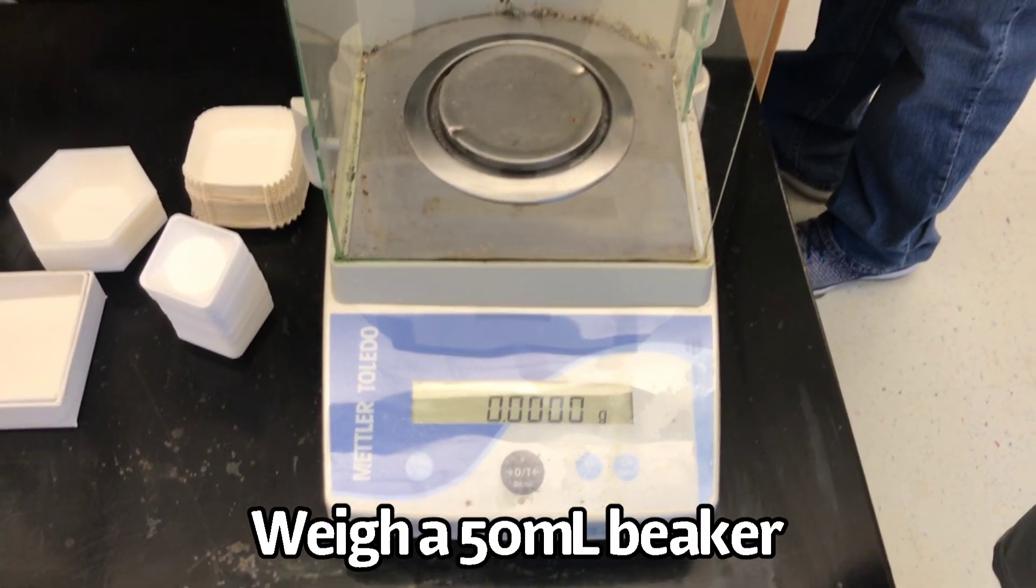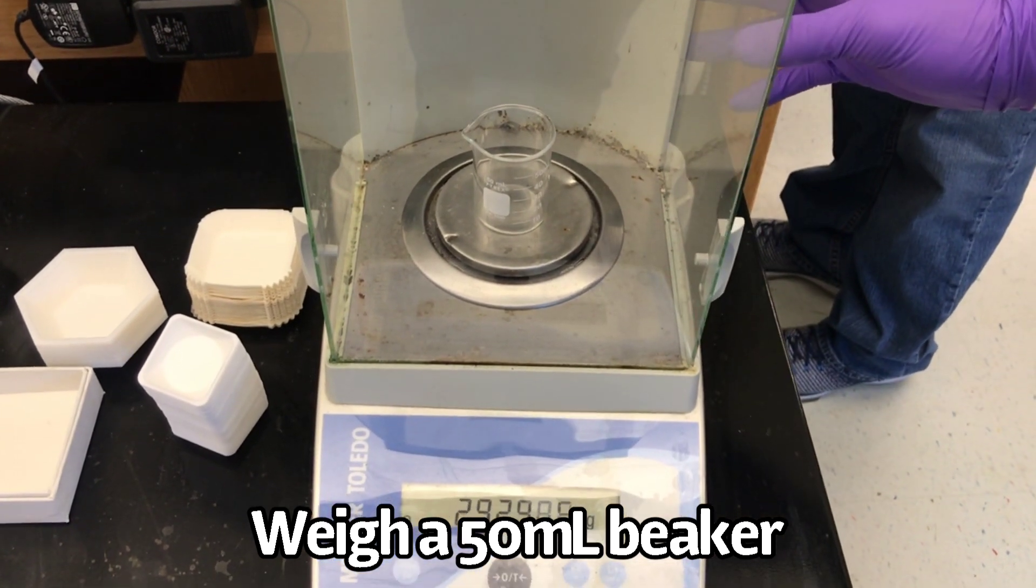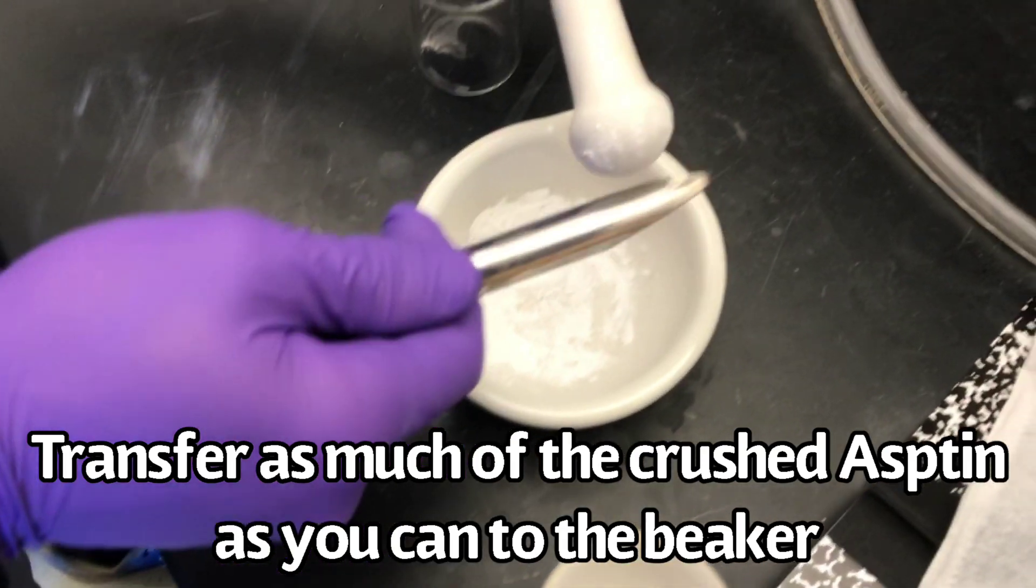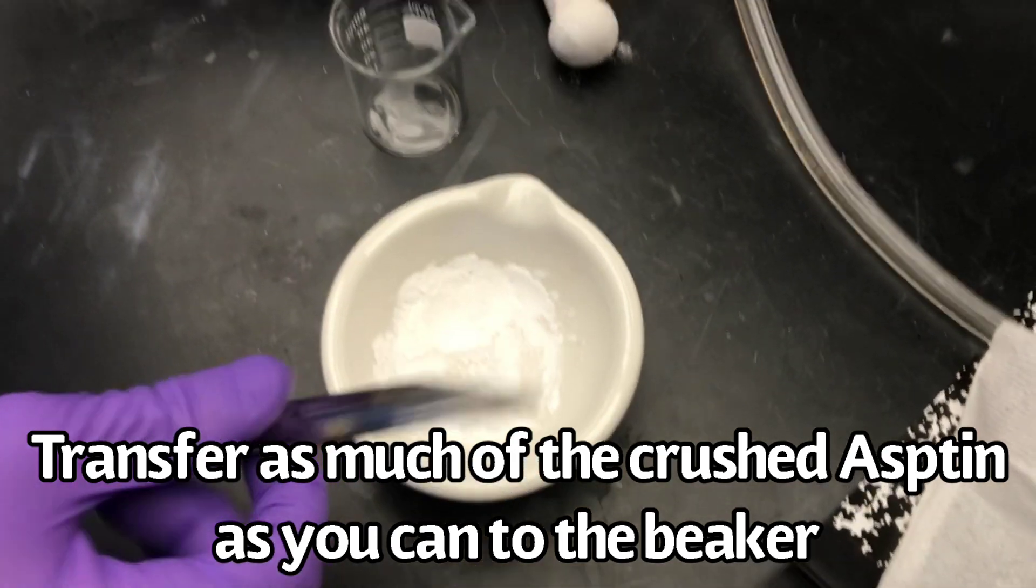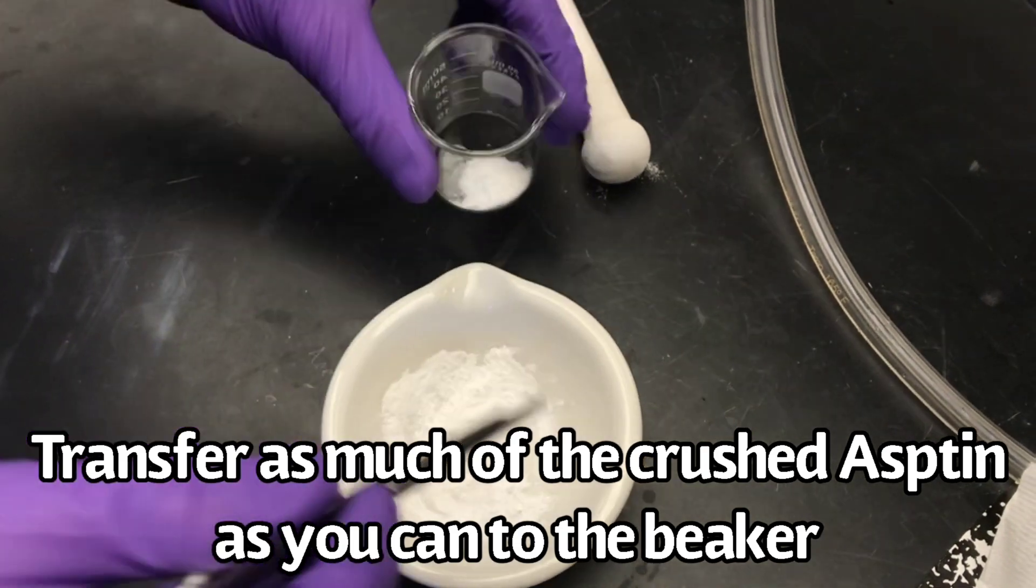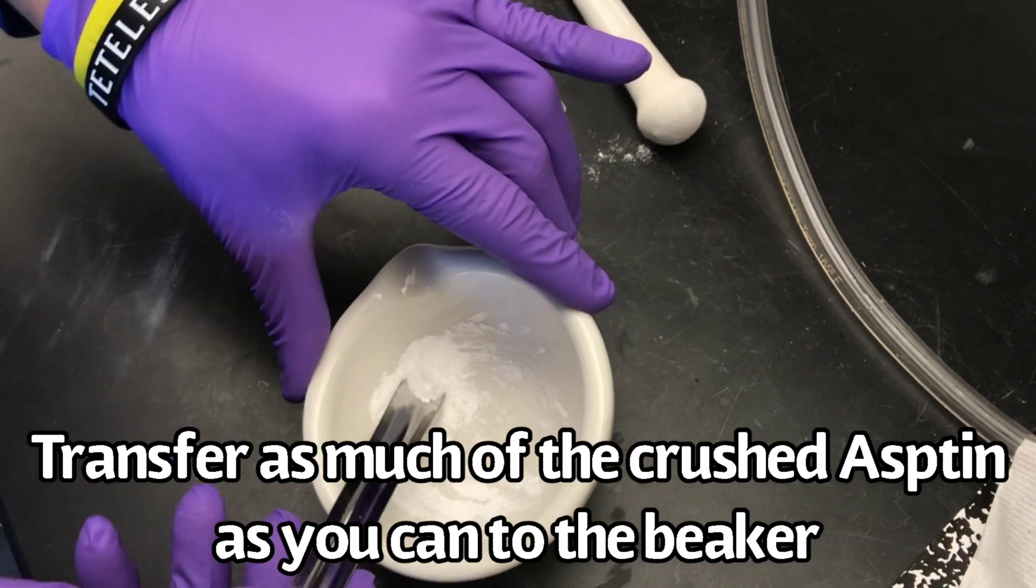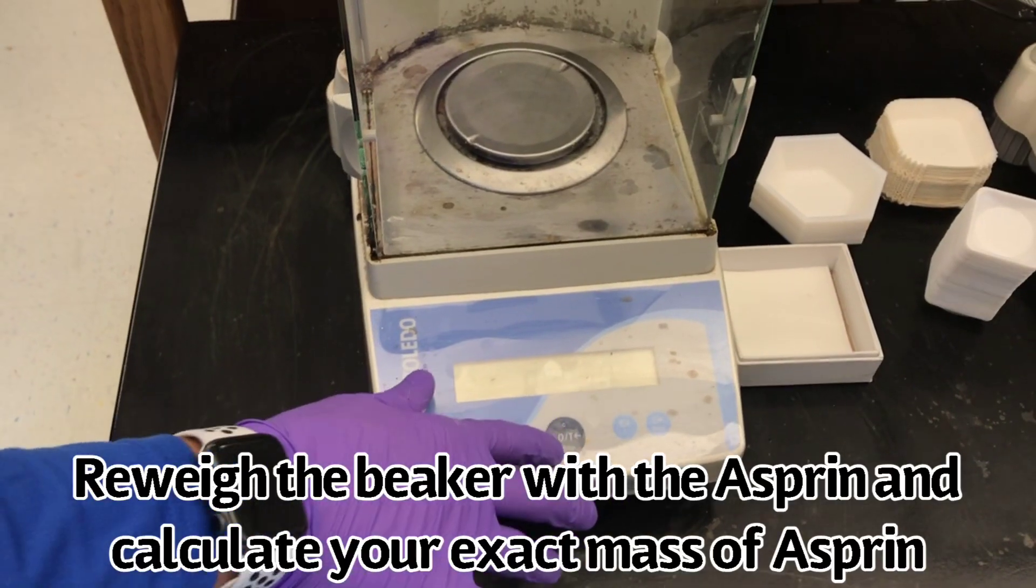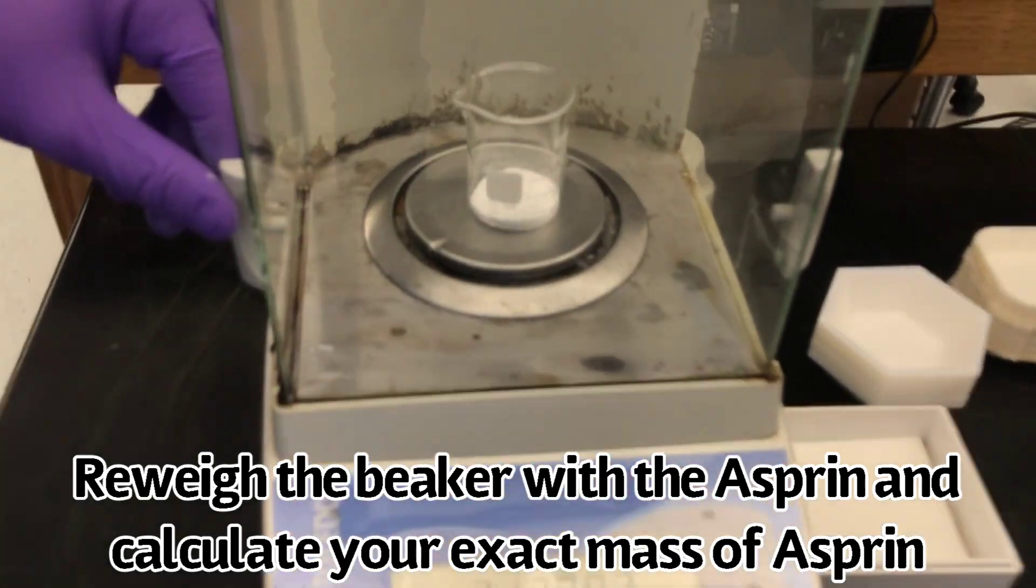Next, weigh a 50ml beaker. Transfer as much of the crushed aspirin tablet into the beaker as you can. Reweigh the beaker with the crushed aspirin and calculate the exact mass of aspirin used.